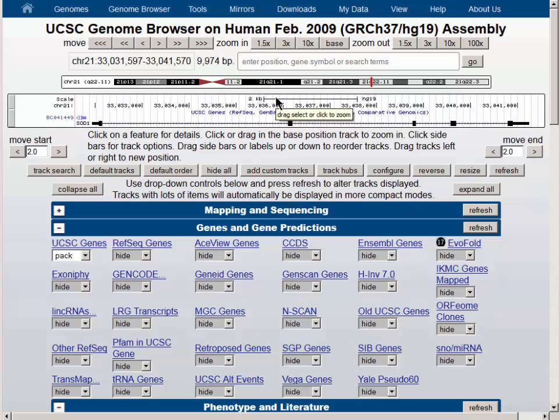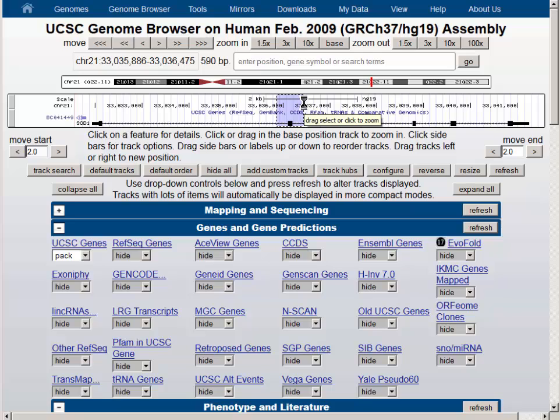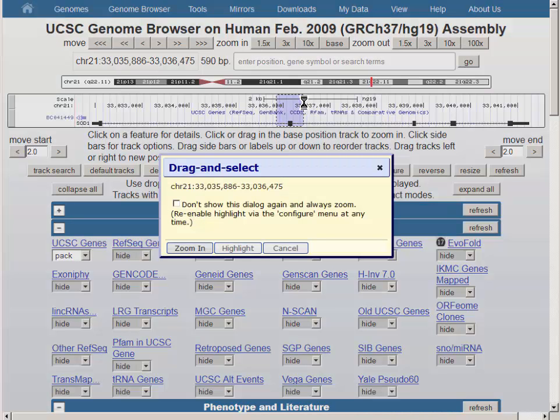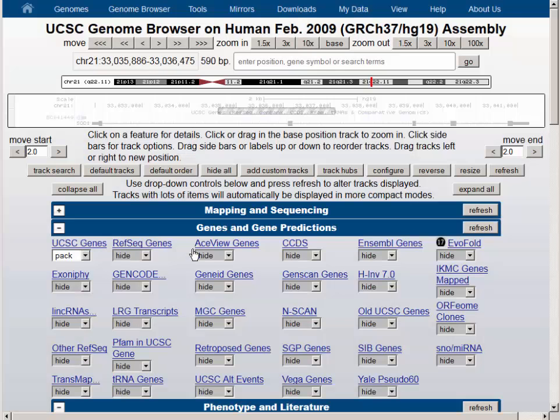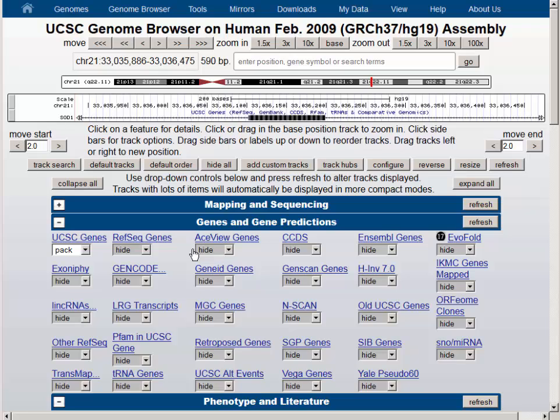If you are interested to know which exon you are at when you are in a zoomed position where you can see only one or a few exons, let's go there first by clicking on the region and dragging it to the right or left to highlight the area. We will zoom into this region, and now we can see by the stripes the scale, and we can see the individual codons in alternating light and dark colors.